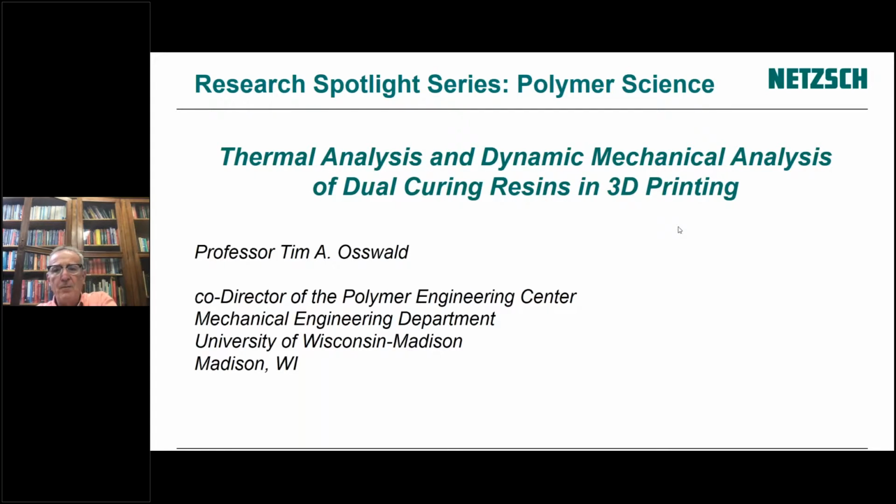I think one of the listeners is Nora Catalina Restrepo, and she did a nonlinear regression fit to get those constants. But yeah, I think a lot of it is a matter of taste. But they are available in the software, I think. And I believe Alec did not play around with them. He just used Friedman. He may have done it. I don't know. Maybe if he's in the vicinity, he can chime in.